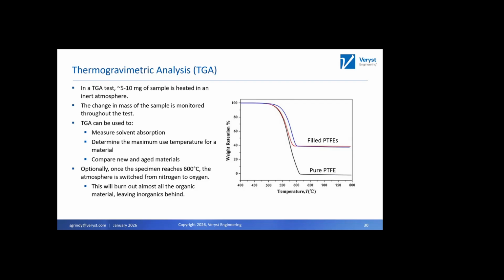And someone else asked if Tg is a range or a discrete value, depending on if it's a thermoplastic versus thermoset. So the thermoplastic versus thermoset wouldn't change how I would report the Tg for the material. I'd base it on either a DMA test or a DSC test. And that's the right way to answer this.